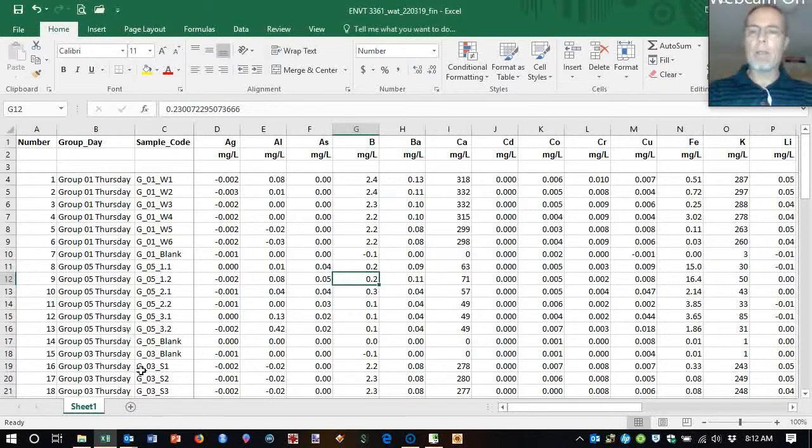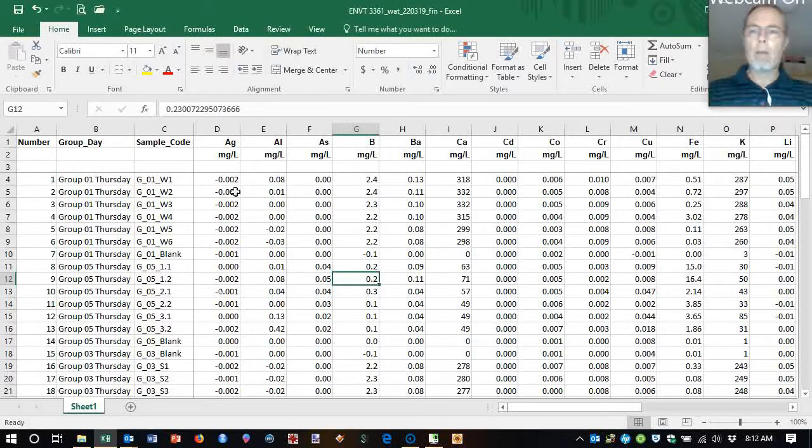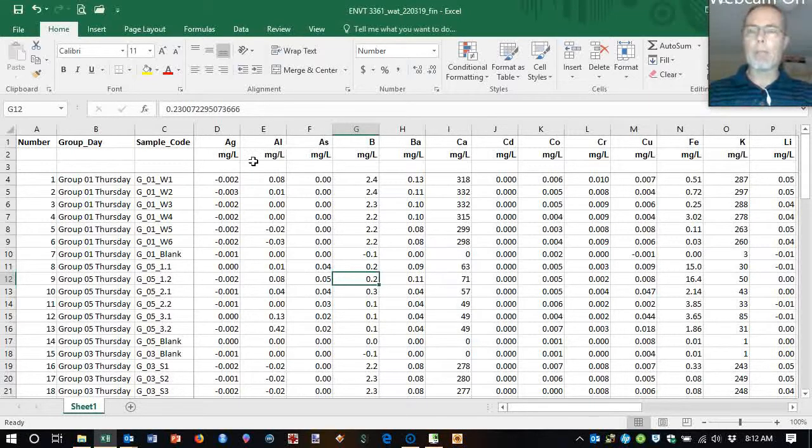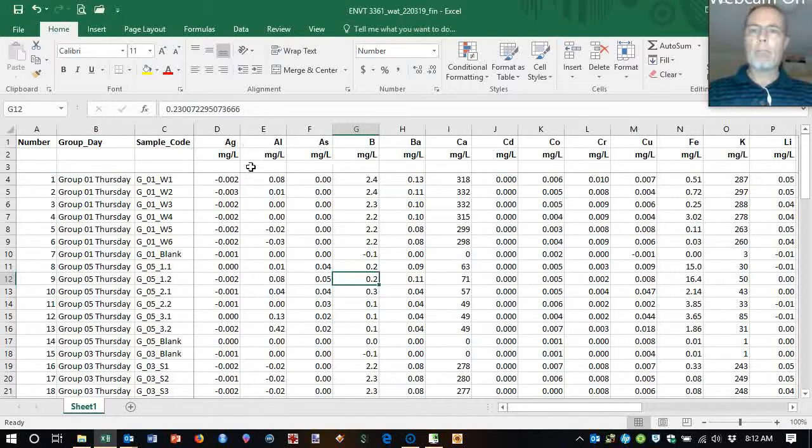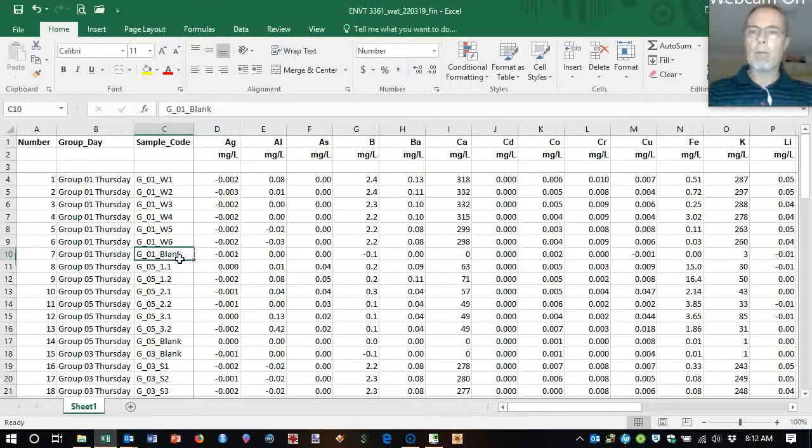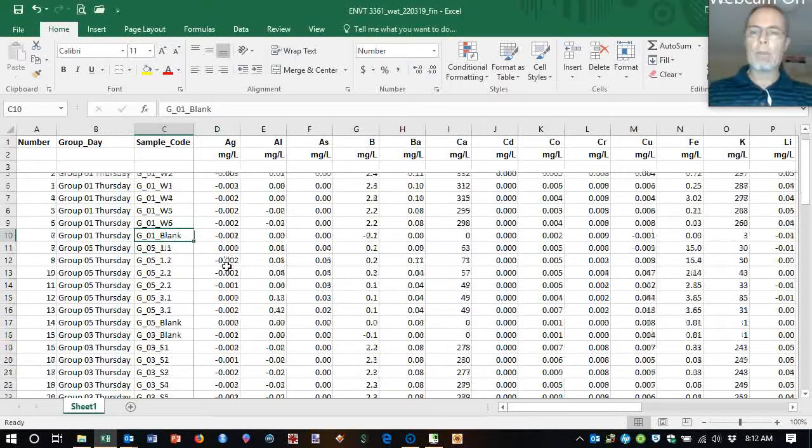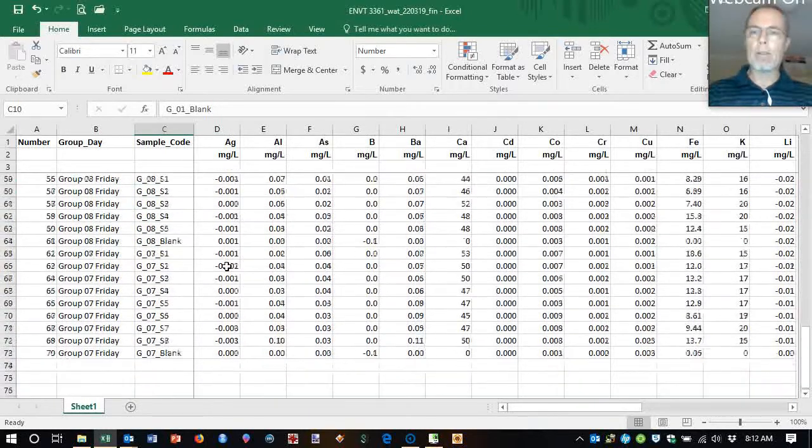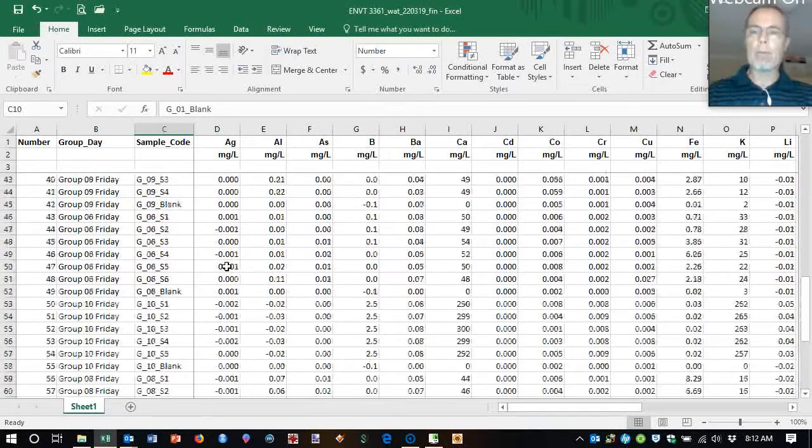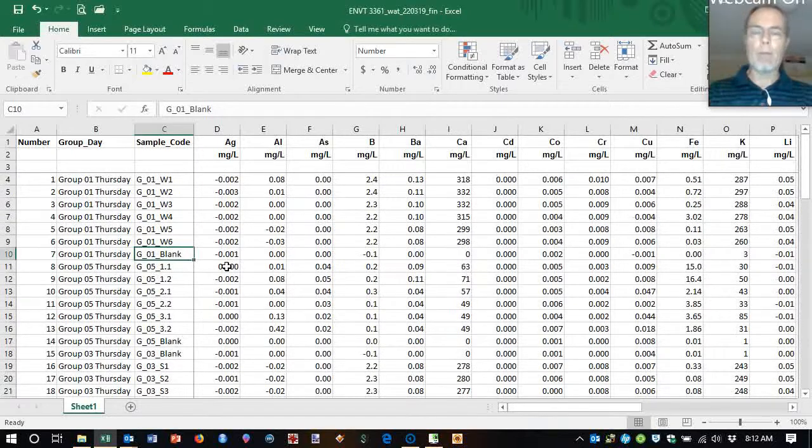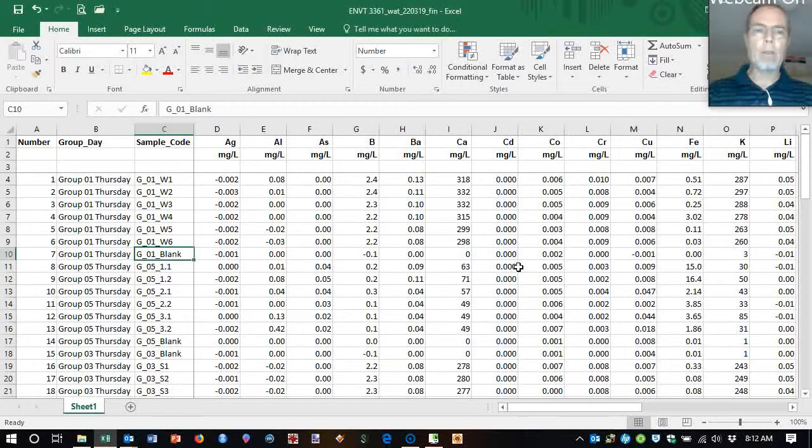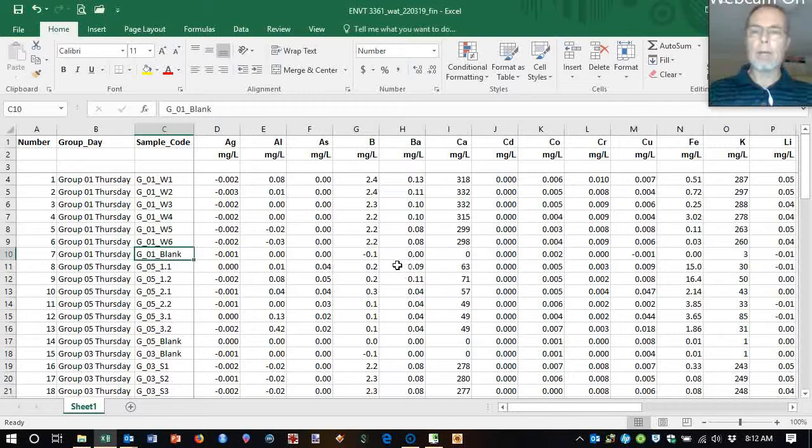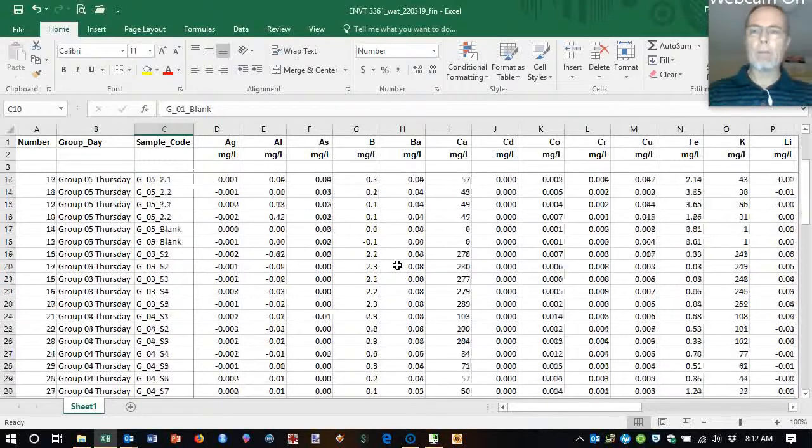So here is our information and we've got a number of things that won't work very well in R. For example, we've got multiple rows of column headings. The data includes the blank and so on, and a number of negative numbers. We need to figure out how to fix all this up.